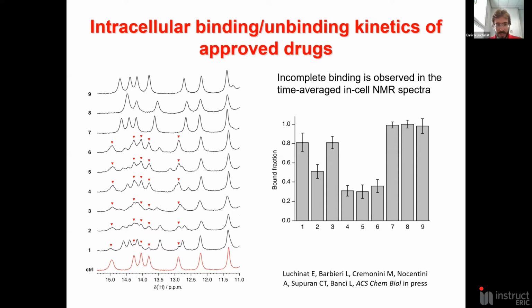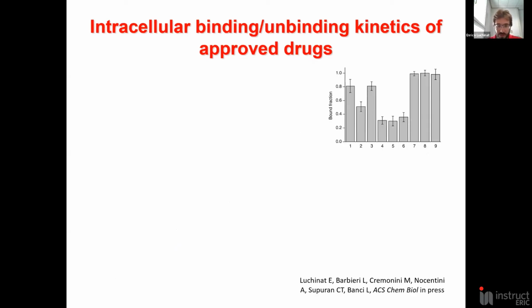We further analyzed the dose dependence and the time dependence of these compounds, and then we also performed time-resolved NMR analysis directly in the tube. So by performing several short experiments in 30 minutes to 1 hour, with these data we could divide these compounds in 3 different classes. The first one was the most obvious, the fast diffusing, strong binding compounds.